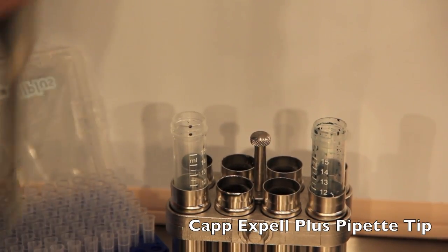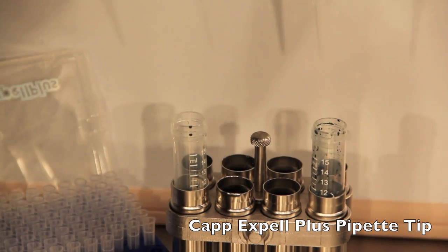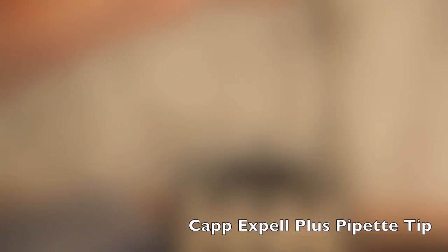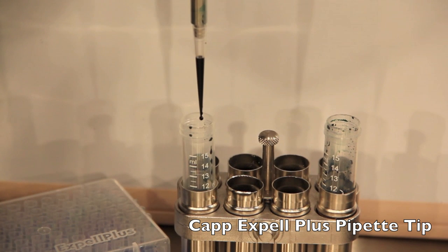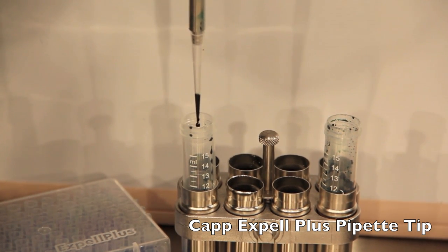To demonstrate the low retention characteristics of these pipette tips, I will be pipetting a very concentrated, highly colored sample. As you can see during the dispensing, very little of the sample is remaining in the tip.